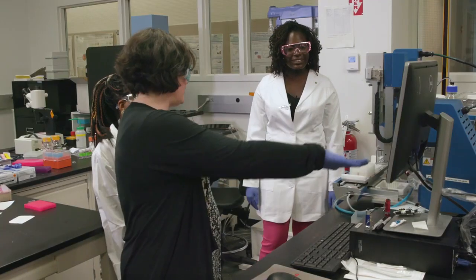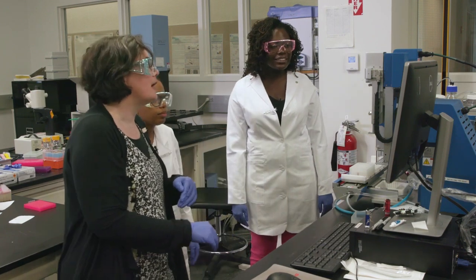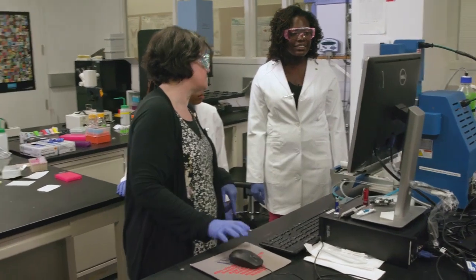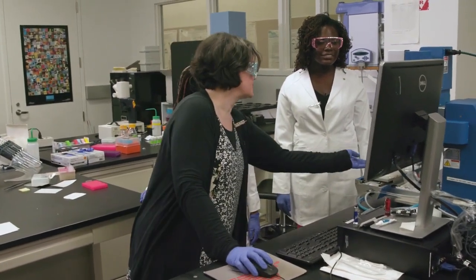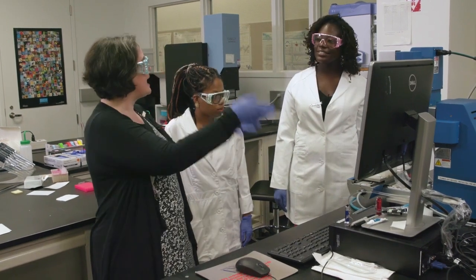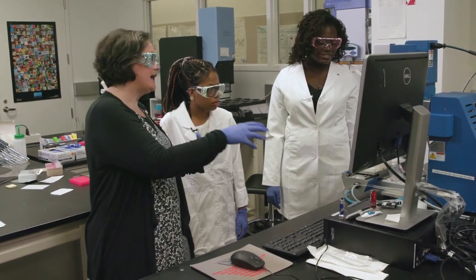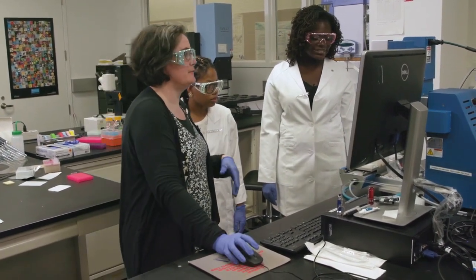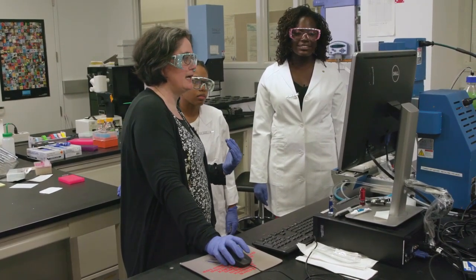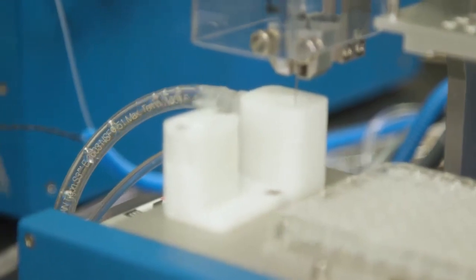So we've got everything already all set up here. It's going to wash the syringes, it's going to wash the special syringe that the protein goes into, and then it's going to pull stuff up out of here, deliver it into the 96-well tray, and then it's going to pull the protein out and deliver that in really tiny volumes, which is why we use robots. So let's go ahead and use that. So we're just washing with water right now.